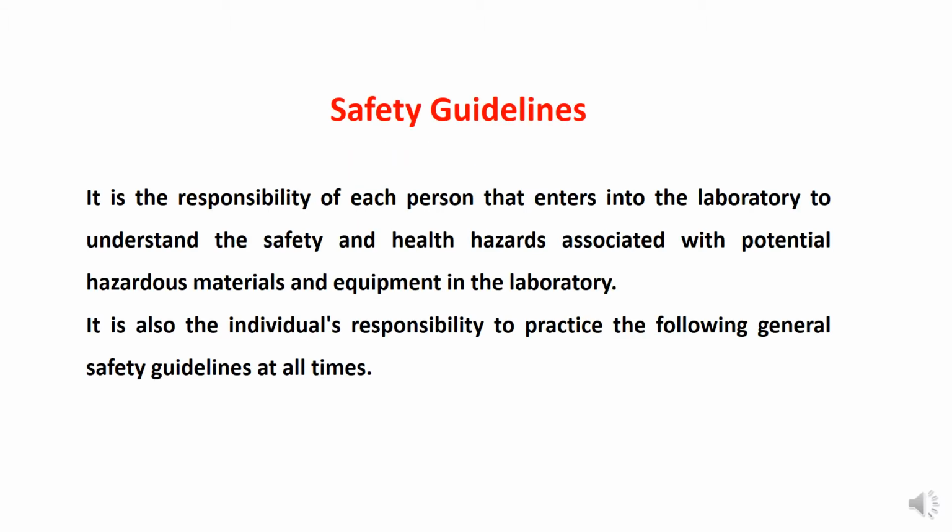Since we already covered the basic lab safety guidelines in the beginning lectures, off and on according to the contents of the lecture, I will remind you about certain specific guidelines. For this lecture, for instance, it is the responsibility of each person, any worker who enters the lab, to read the instructions on the main entrance door. That is really important.